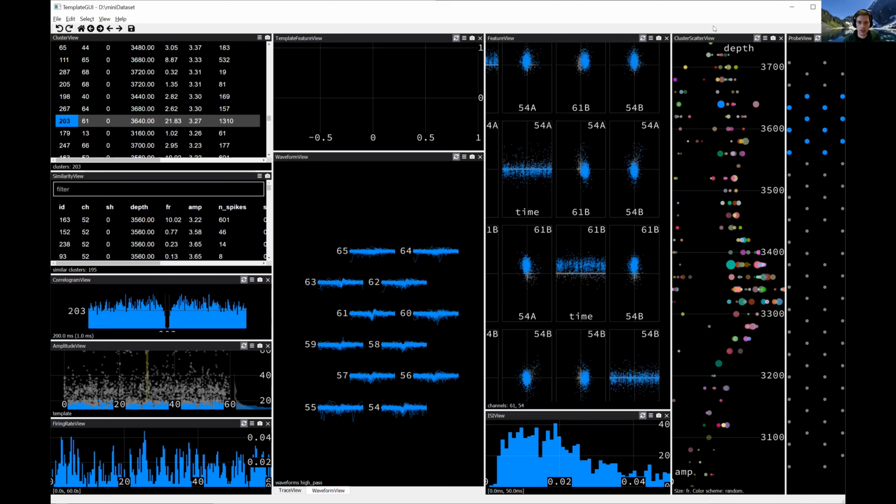Yeah, were there any questions in the Q&A on this stuff? Let's see. Horizontal gray line in the Correlogram view. Good question. In the Correlogram view, there's a horizontal gray line here, which is the mean firing rate of the neuron across all time points. And so that's the expected level of spiking in a bin if that time point is just independent of the other time point.